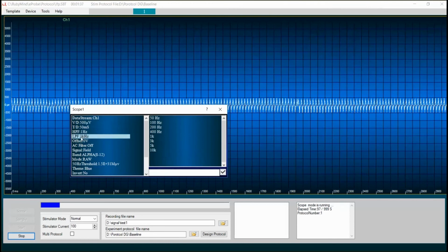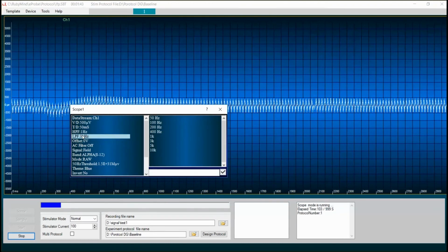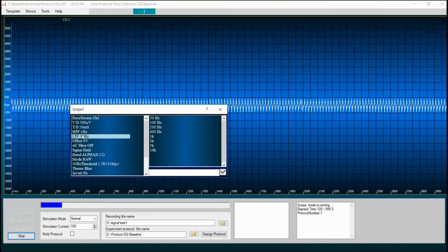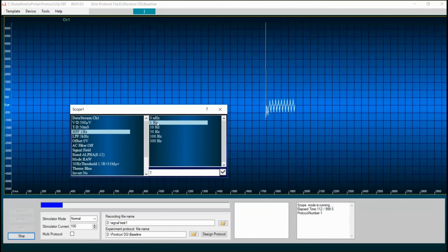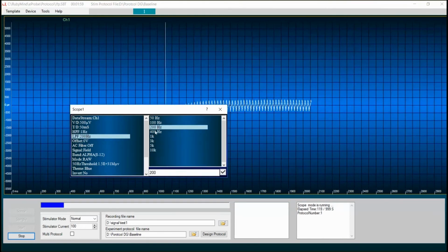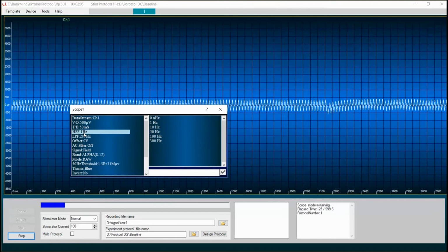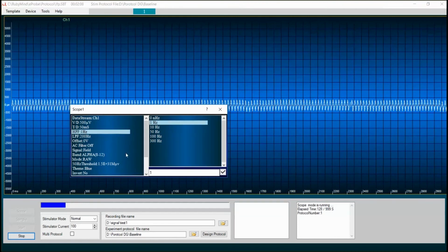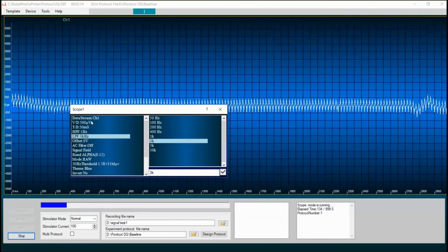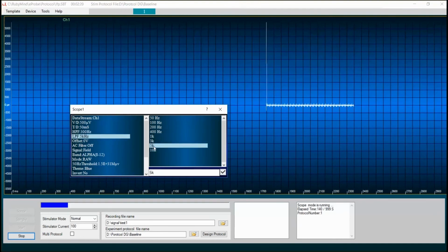The other options are HPF and LPF, high-pass filter and low-pass filter. For different recordings, we set the filters with different numbers. If we want to have ECoG, standing for electrocorticography, HPF is set to 1 Hz and LPF to 100 or 200 Hz. If we want to record LTP for learning and memory, we set HPF to 1 Hz and LPF to 3 kHz. For recording single unit, HPF becomes 300 Hz and LPF 3 to 5 kHz.